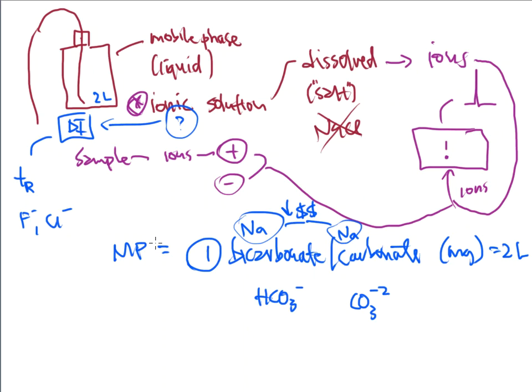The reason that we use the combo and not just one or the other, well, as you can already see, what they're doing is that they are carrying different charges here, -1s and -2s. So the multiple charges will allow for better separation.